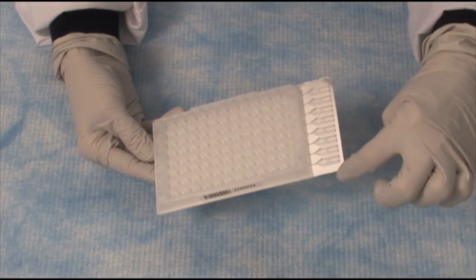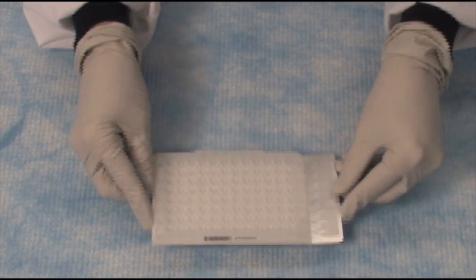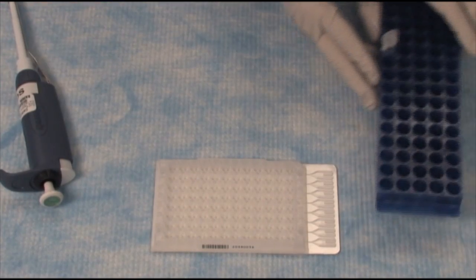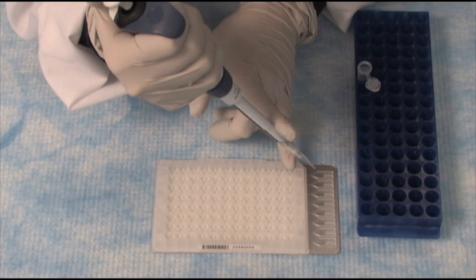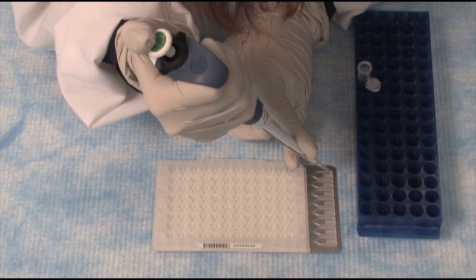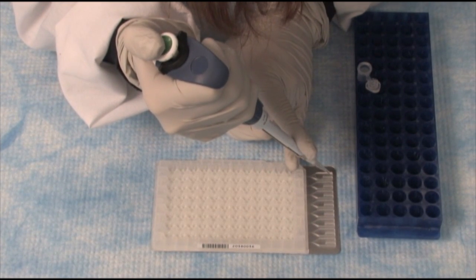Now we're ready to load the card, and it's really quite simple. Each of the different ports is labeled one through eight. The Pipetman is set to 100 microliters, because that's the amount I'm going to put into each of the ports. I'll bring in my sample, and now I'm ready to load the card. I'll go into the larger of the fill ports, add in the pipette tip, and pipette my sample.